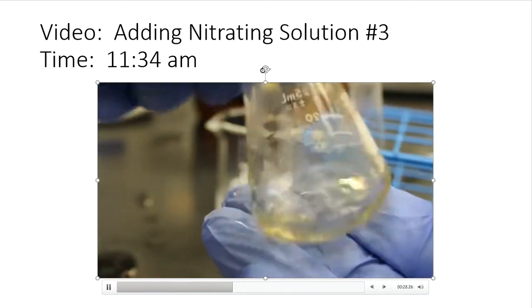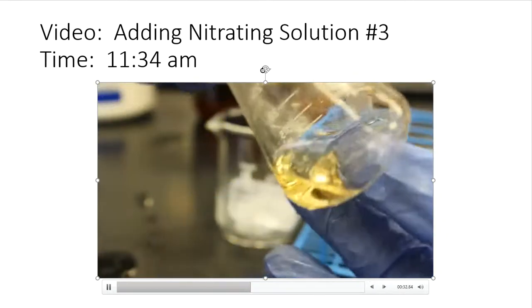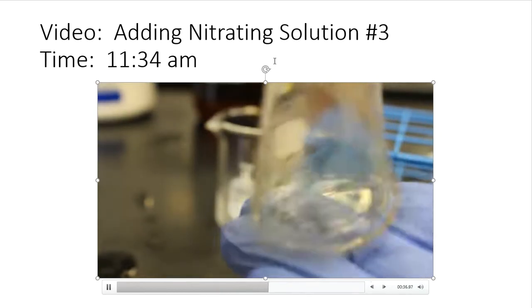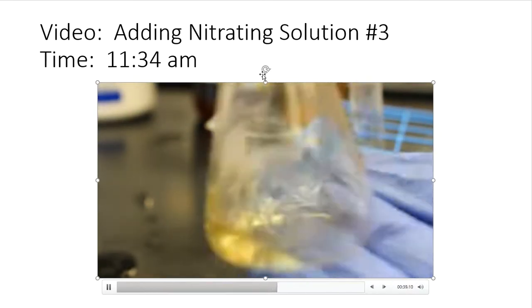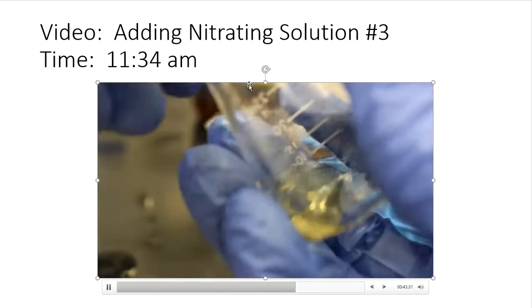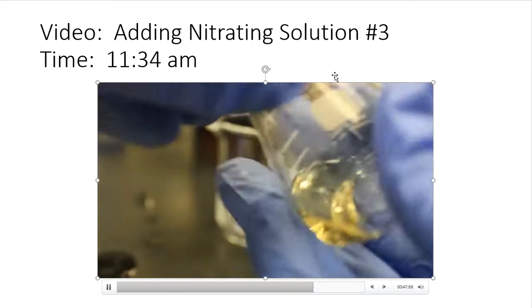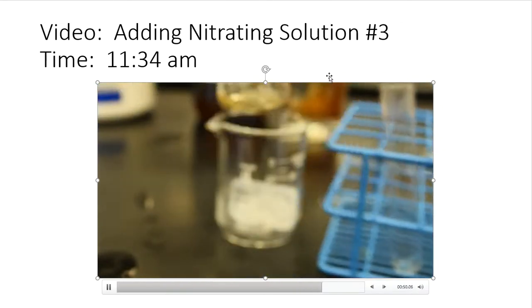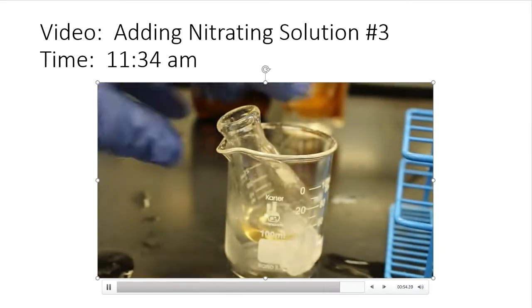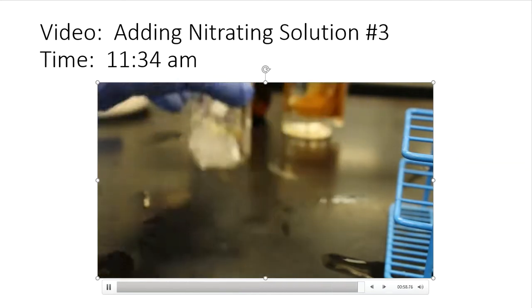And there you go. So not as exciting as the first 2, but we can at least report a change. We can see something different now than what it was in the beginning. So you can make those notes down as you want. Notice my fingers. It is generating quite a bit of heat at the very bottom. So in the ice bath it goes. And now, folks, I just need to wait. I need to wait on these 3. This happened at 11:34 that morning.